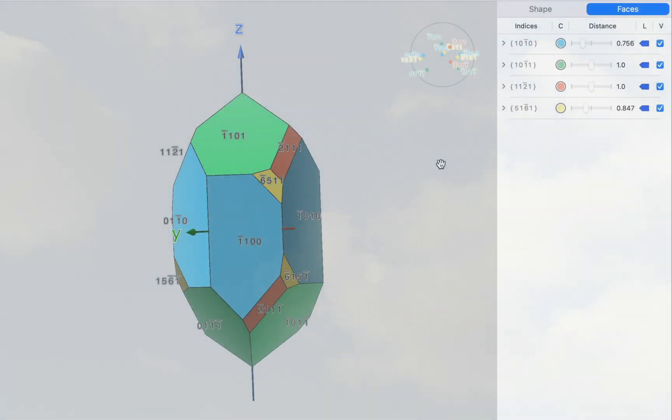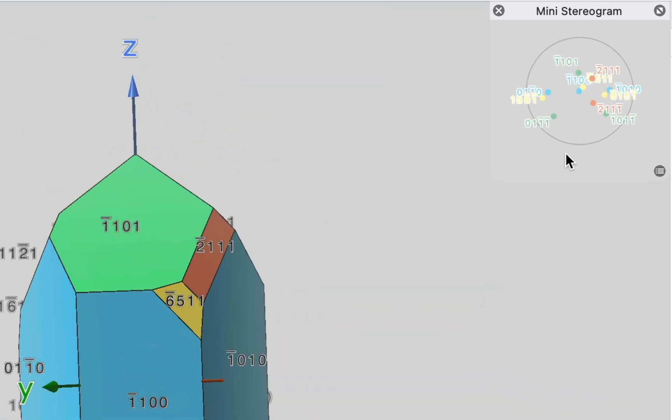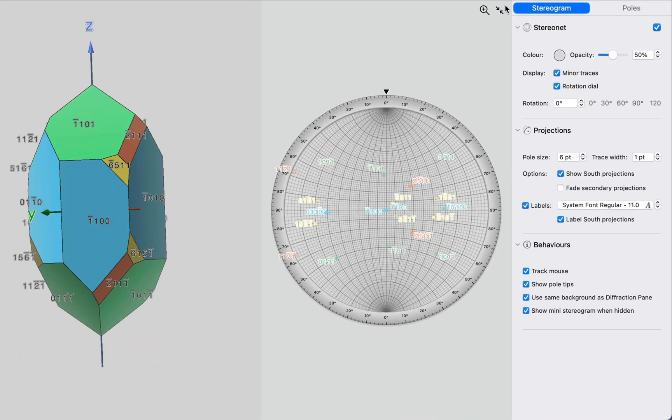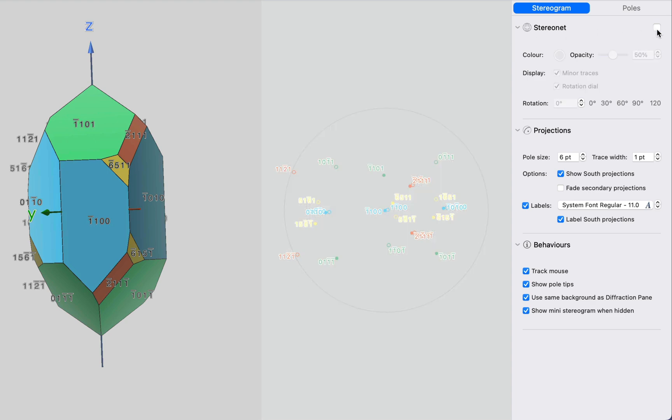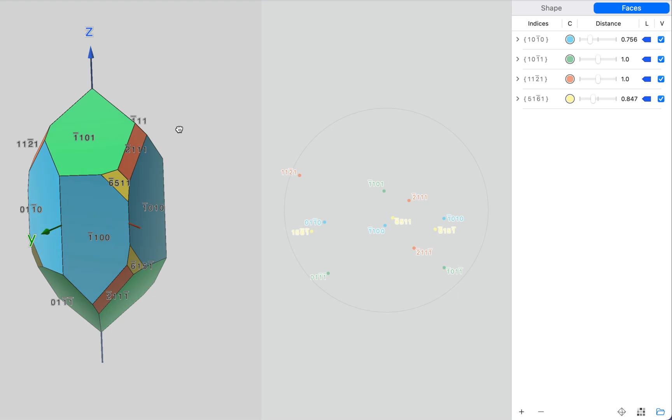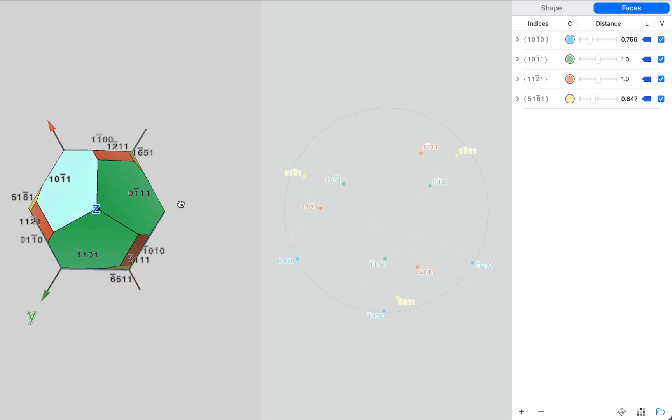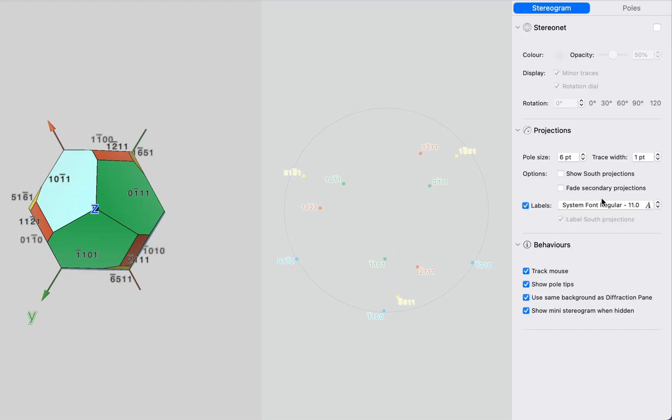Now, you may notice that in the top right-hand corner of this window, we have this mini stereogram. And this is a two-dimensional projection of our face normals. Now, we can zoom this up and see a larger stereogram. We now have our stereogram inspector on the right-hand side. I'm going to turn off the stereonet and turn off the south projections as well. Let's look down the crystal z-axis. Let's make the stereogram a bit clearer. We'll increase the font size here.